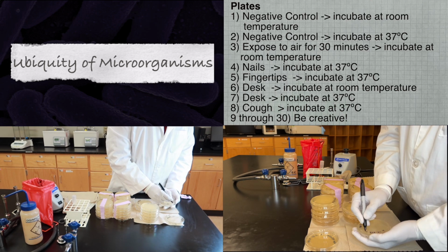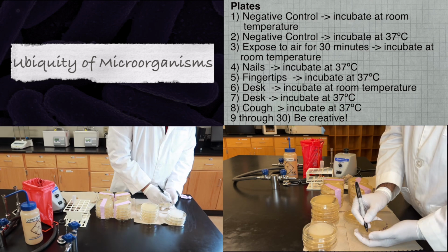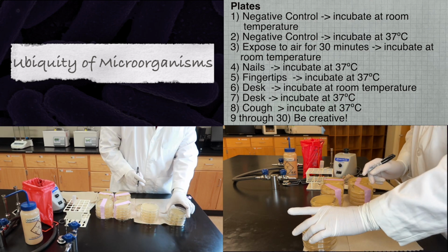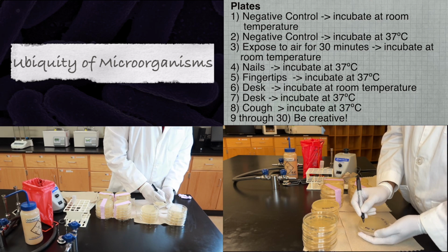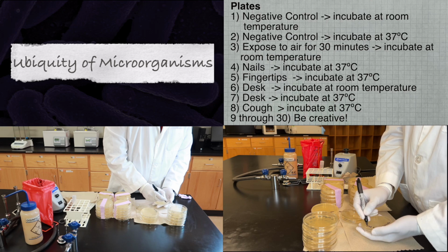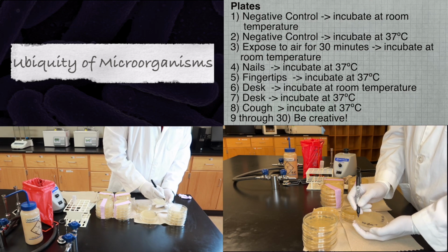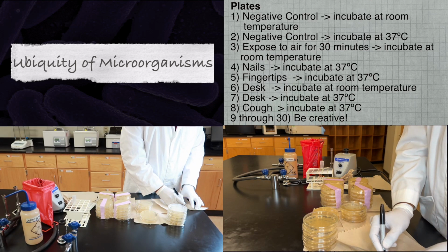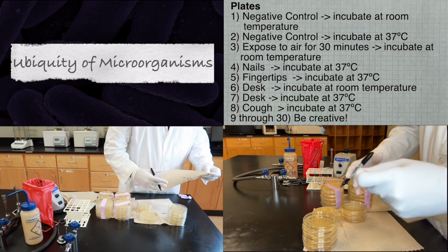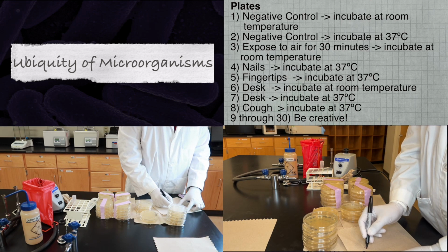When you label a plate, please ensure you write the plate number, where the sample is taken from, what temperature the sample is going to be grown at, your table number, your professor's last name, and the day and time of your class. Next, please label 2 paper towels, one with room temperature and the other labeled 37 degrees Celsius.